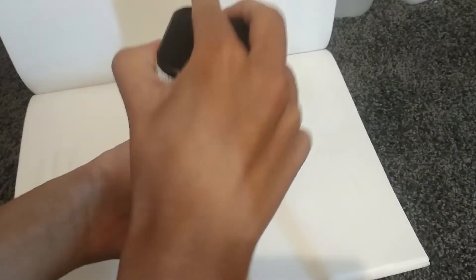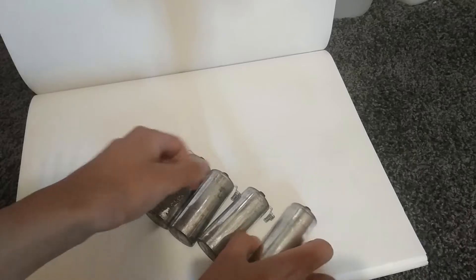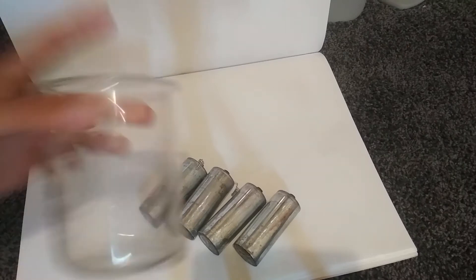Today we'll be extracting manganese metal from these lantern batteries that I picked up at the store. We'll just pull them apart and salvage the juicy insides of the battery.